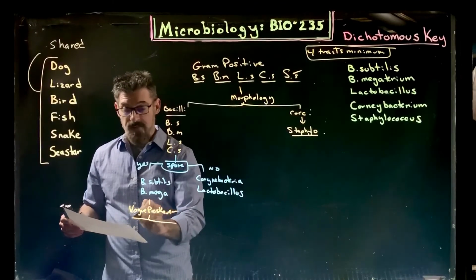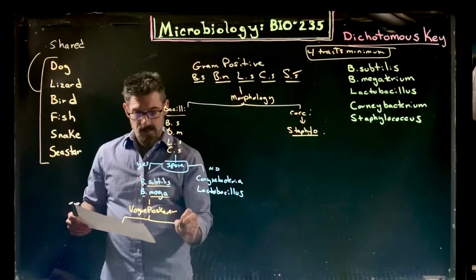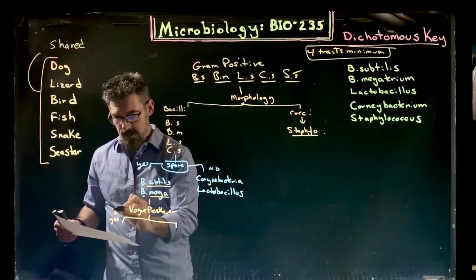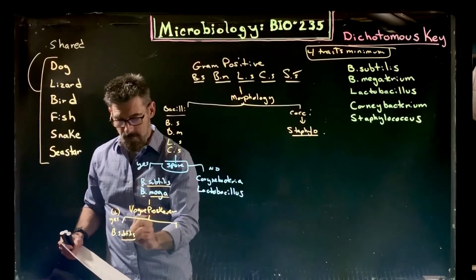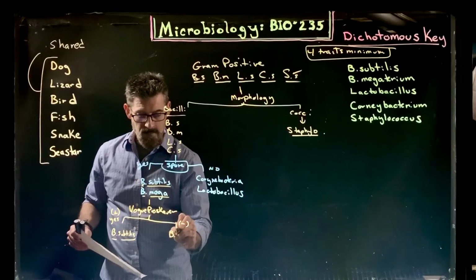Is one of the few things that's going to help us tell the difference between Bacillus subtilis and Bacillus megaterium. So yes, positive test result is going to be the B. subtilis, and negative is B. megaterium.